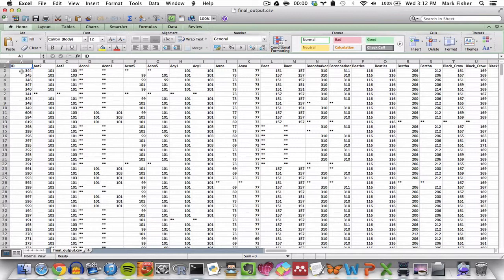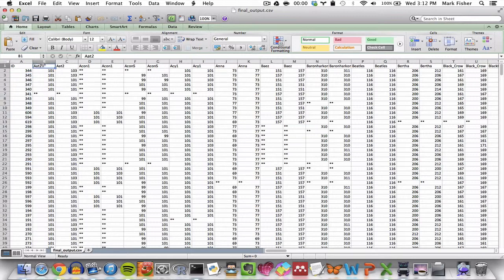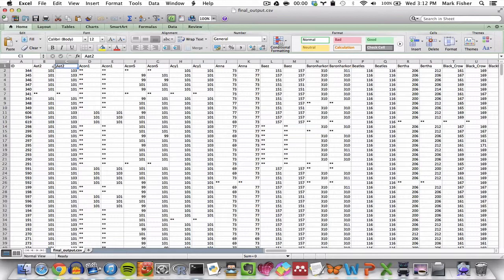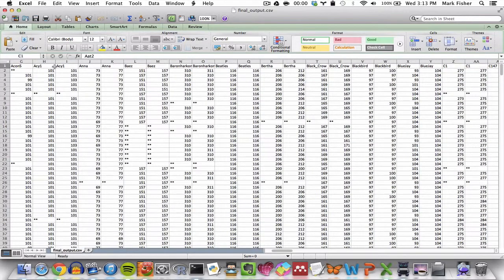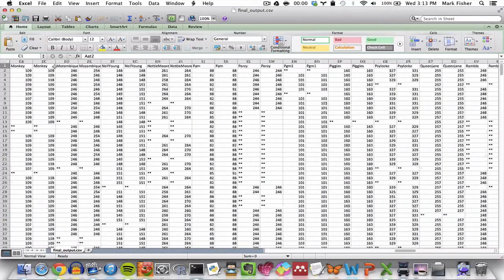So here it is opened. So the first thing you notice is that it's not sorted by ID, which you can very easily do, of course, in Excel. But all of the loci and keep lists are listed, two columns per locus, so each column represents an allele, at all the loci on keep lists.